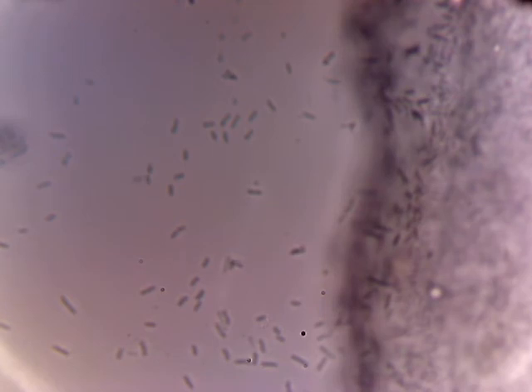It's chugging along merrily. No problems yet. It's going on 24 hours worth of observation now. Anyway, take a close look and you'll see I have located a large group of the fast-moving bacilli bacteria. I'm going to assume they're bacilli because they look pretty much rod-straight. I haven't really seen any that look curlicued, like Spirillum, unfortunately, because I dearly love those.